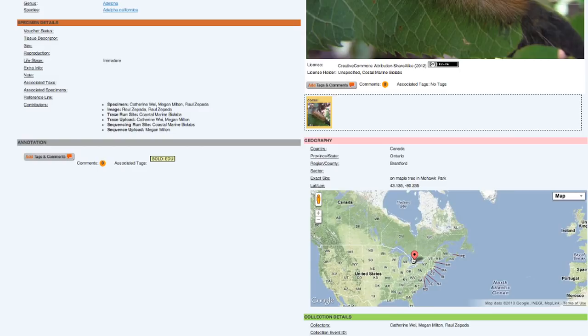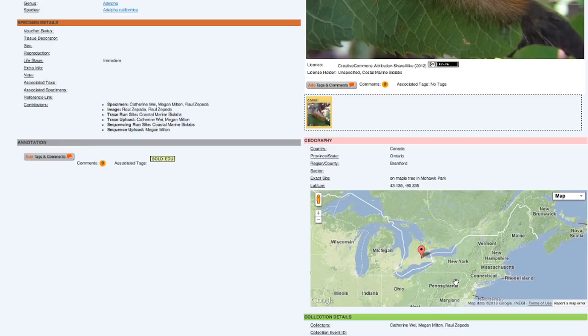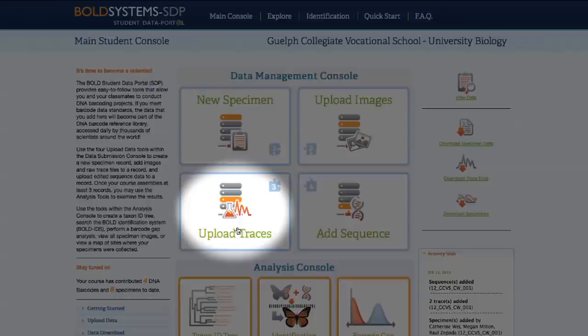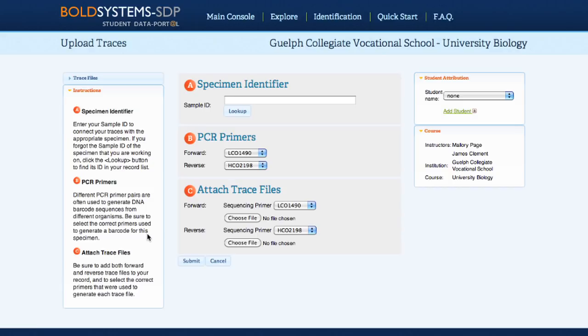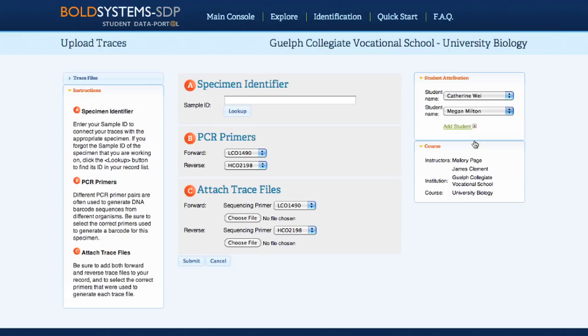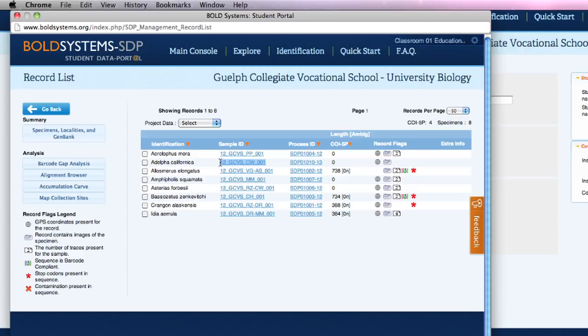A zoomable map of the collection location is available if GPS coordinates were provided. Following image upload, select Upload Traces on the main student console. The trace file uploader has instructions listed down the left-hand side of the page, student attribution is in the top right, and multiple students can be selected. The sample ID lookup tool allows students to quickly and easily find the sample ID for the record they're working on.